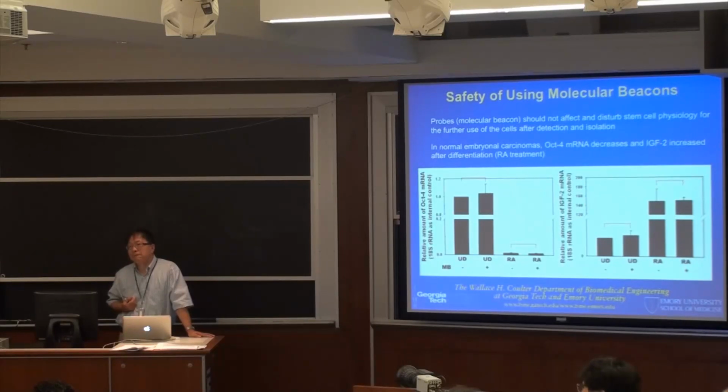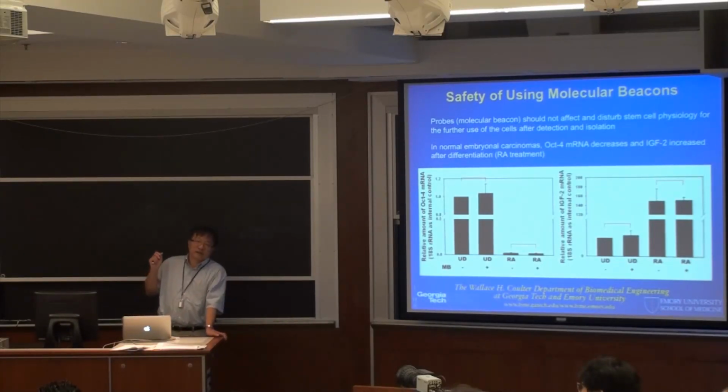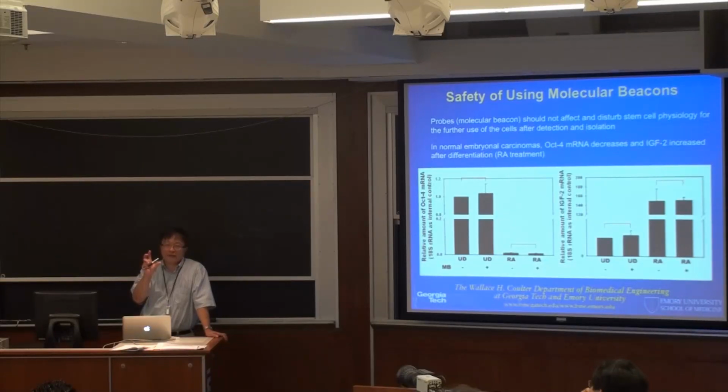With the length of the beacon, do you ever have any problems activating siRNA-related effects? That's another great question. As you know, siRNA molecules usually have a length of 19 to 22 bases, right? And the beacon actually usually is right in that range. It's usually between 15 to 25 bases, right? So we actually have done studies, and that relates to your first question.